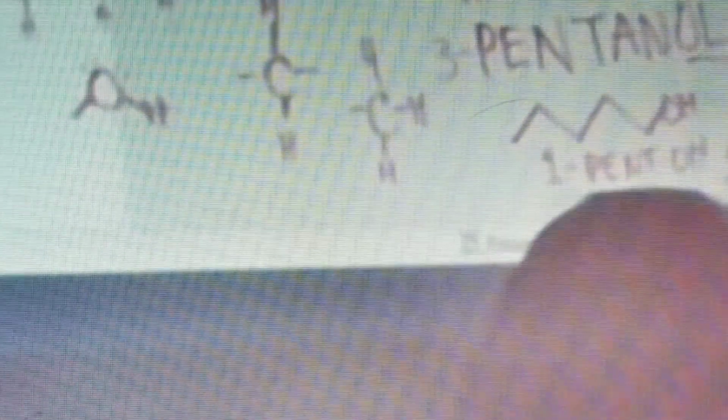Could be 2-pentanol. So it could be 3-pentanol, 1-pentanol, or 2-pentanol. Look at that, guys. We deduced a structure just from one IR.